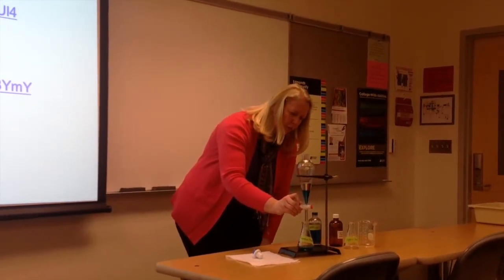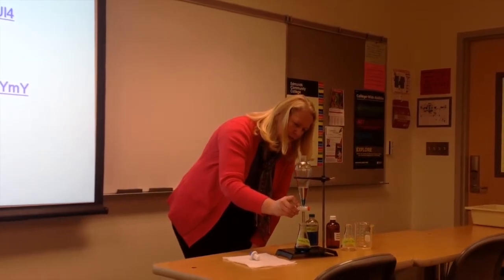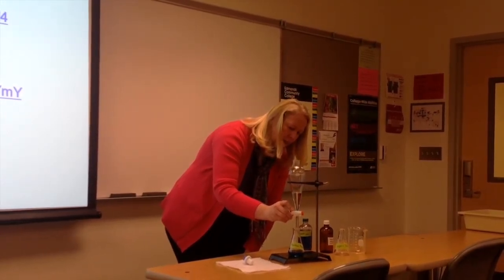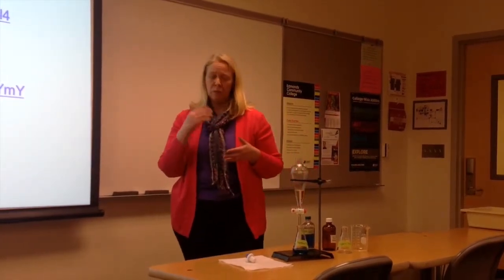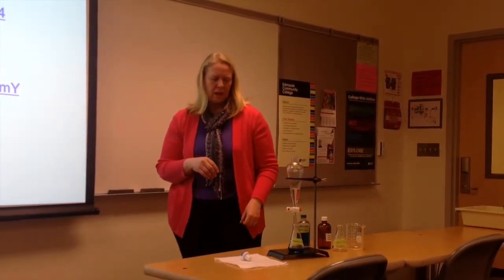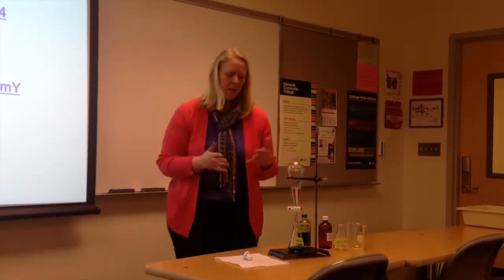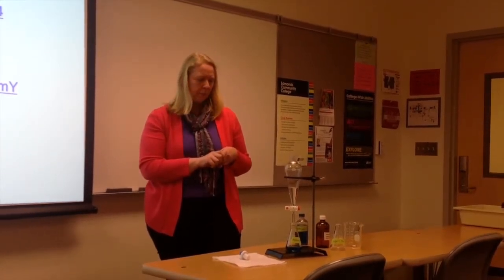And when you get close to the interface, you want to slow down and just drain it carefully. Since we're trying to get compound out from the ether layer, it's okay to leave a tiny bit of aqueous in there because we're going to repeat this process a few times. So it's okay if not every single drop gets transferred. And you do want to make sure that you don't get any ether into the bottom layer. If that happens, you could always pour it back in and try your separation again.